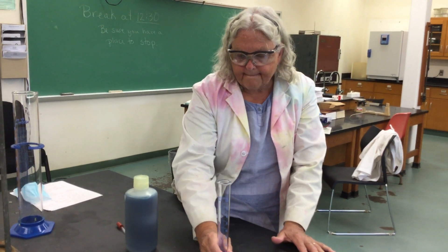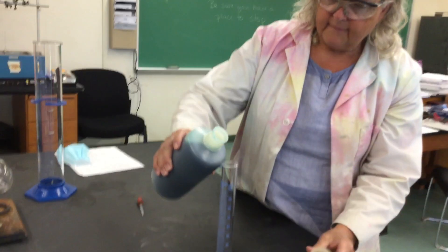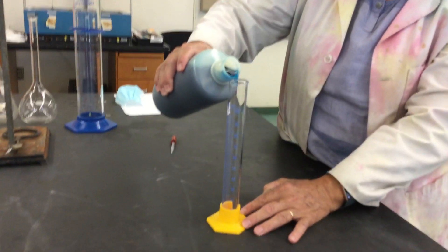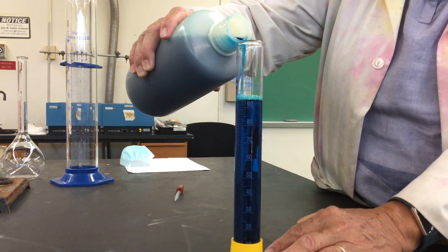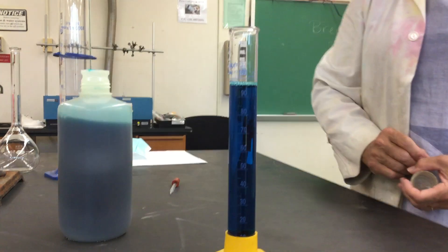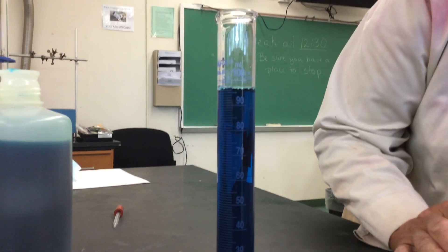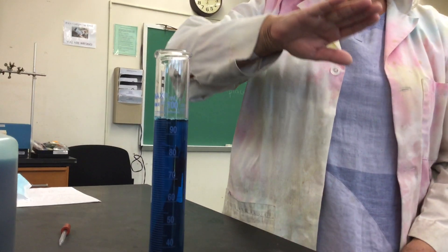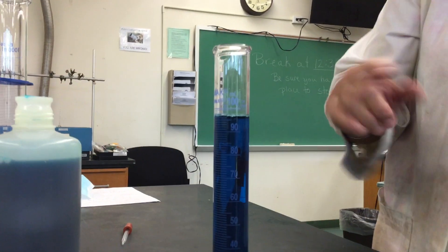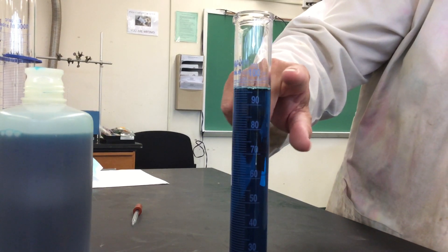Now when you're using it, there are a couple of things you want to be careful of. I'm going to put some blue dye in here. The meniscus is the idea that the top portion of the liquid is kind of sloping down just a little bit — there's a little indent to it. When we read it, we typically read the bottom of the meniscus.